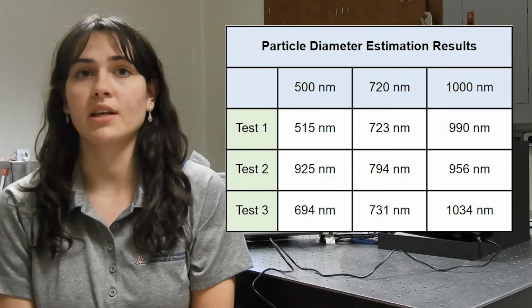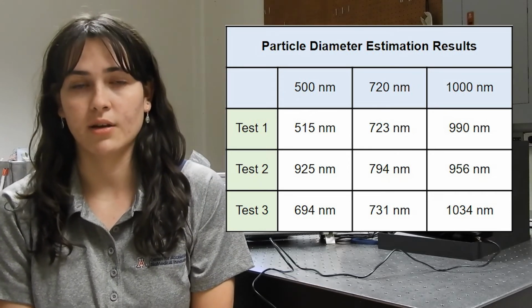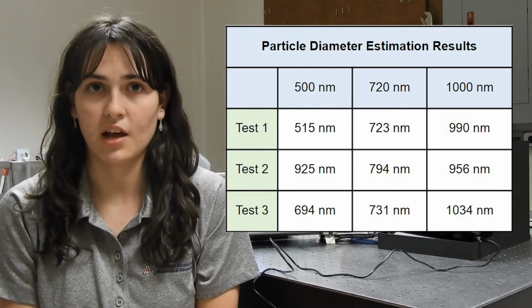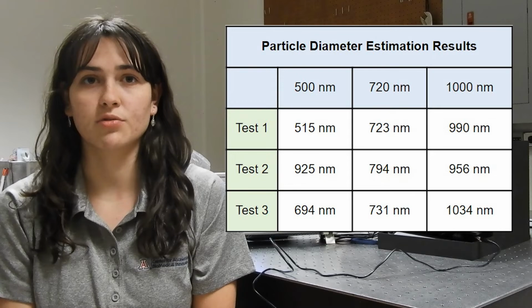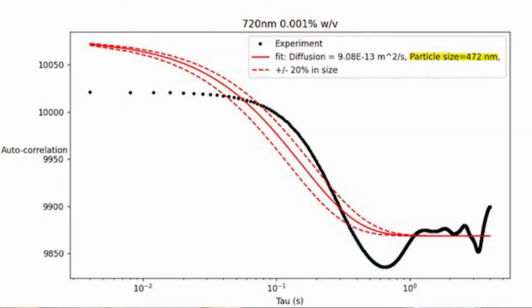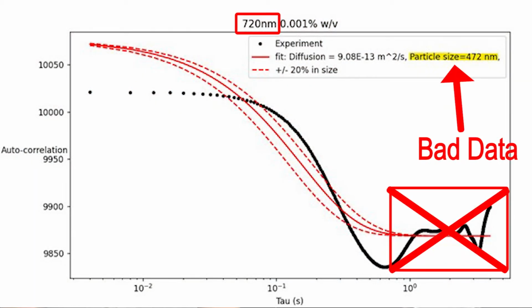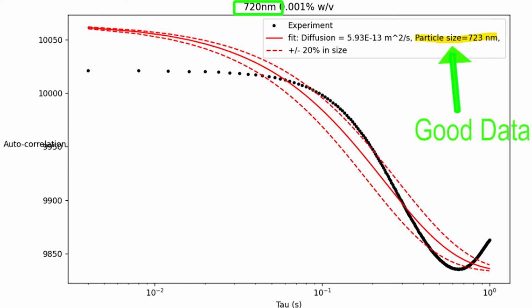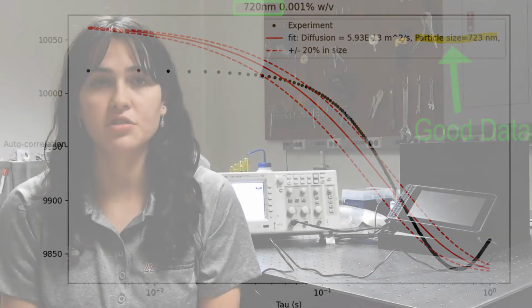We observed that many data points severely overestimated the particle size, which may have been caused by larger particles in the air. Since the rest of the results were pretty consistent, we removed such outliers, which increased our accuracy. We also noticed that the removal of extremely variable segments of the autocorrelation plots improved the accuracy of our calibration curves and our size calculations.